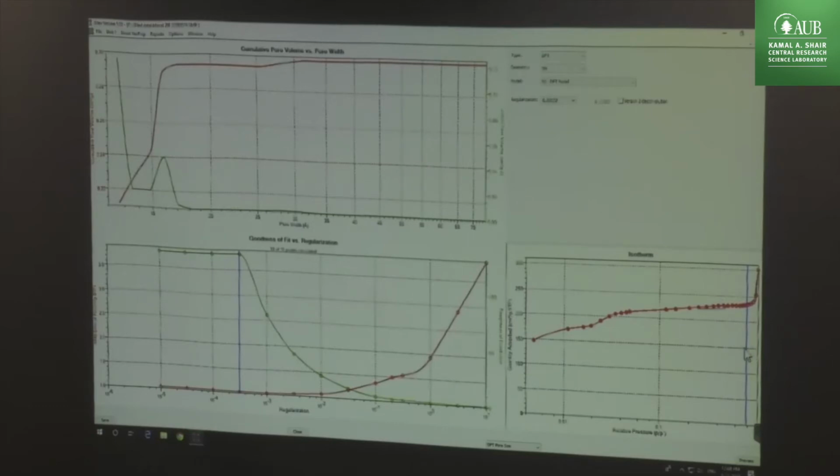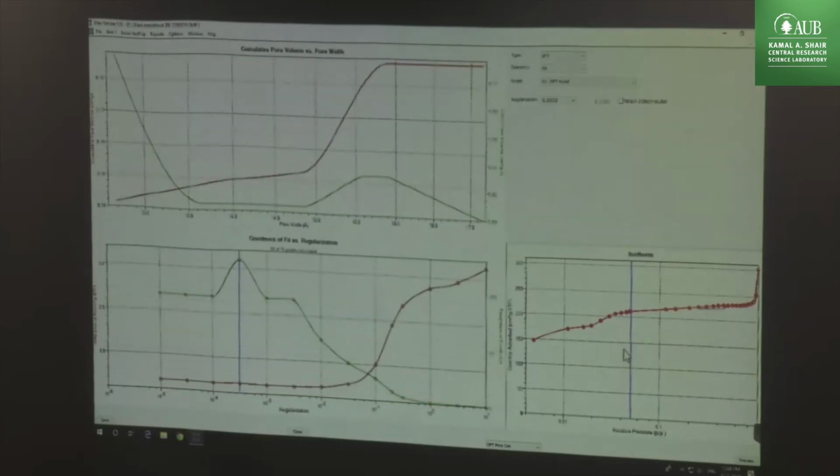How do you know which model to choose? What's the proper model for zeolites? It is hexagonal, just like a hexagon like this. Okay, we have a model for that. We have for the zeolite perfectly. I think we have at least three models for zeolite. Who asked which model we have to select? You? That's a very good question.